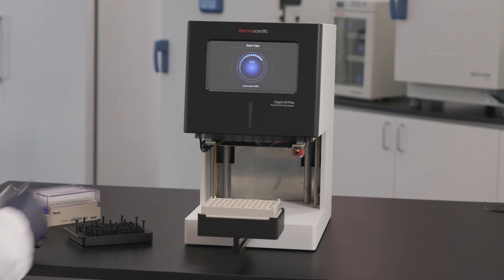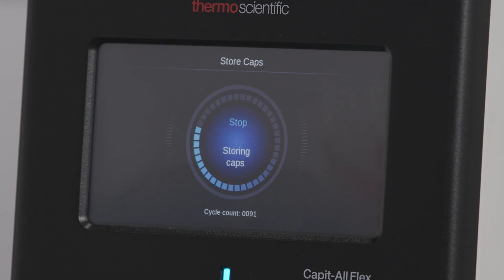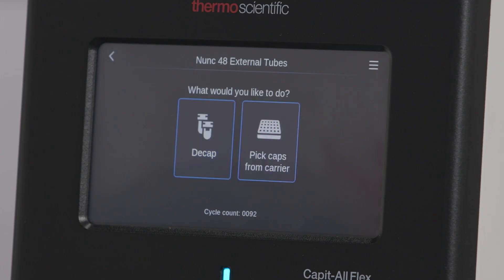When this step is complete, the system will increase the cycle counter by one and return to the home screen. It is now ready to process the next rack of tubes.